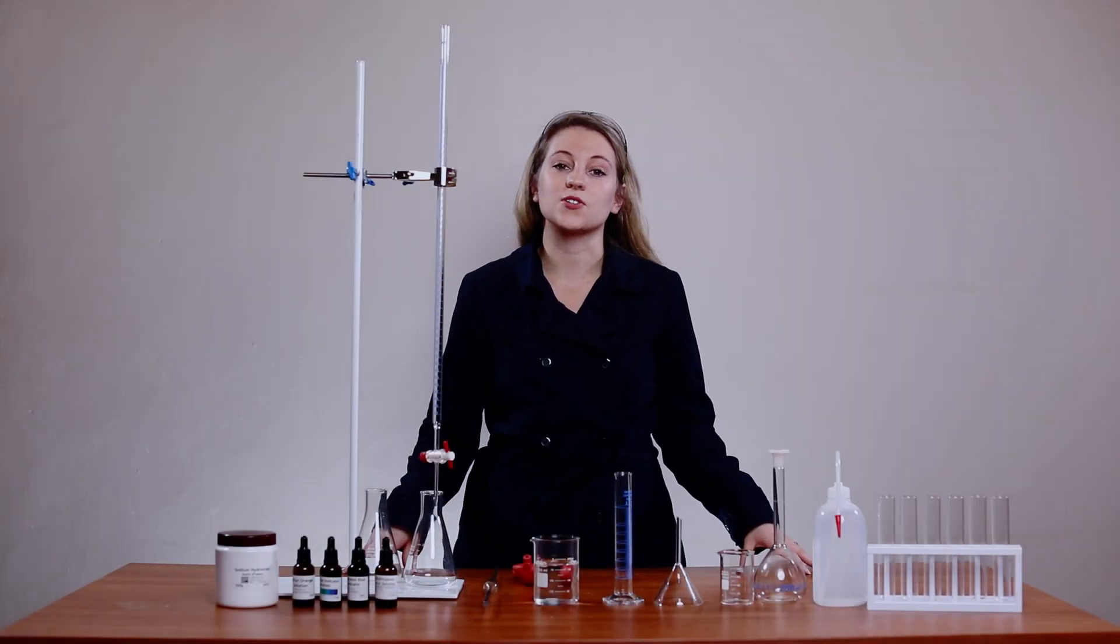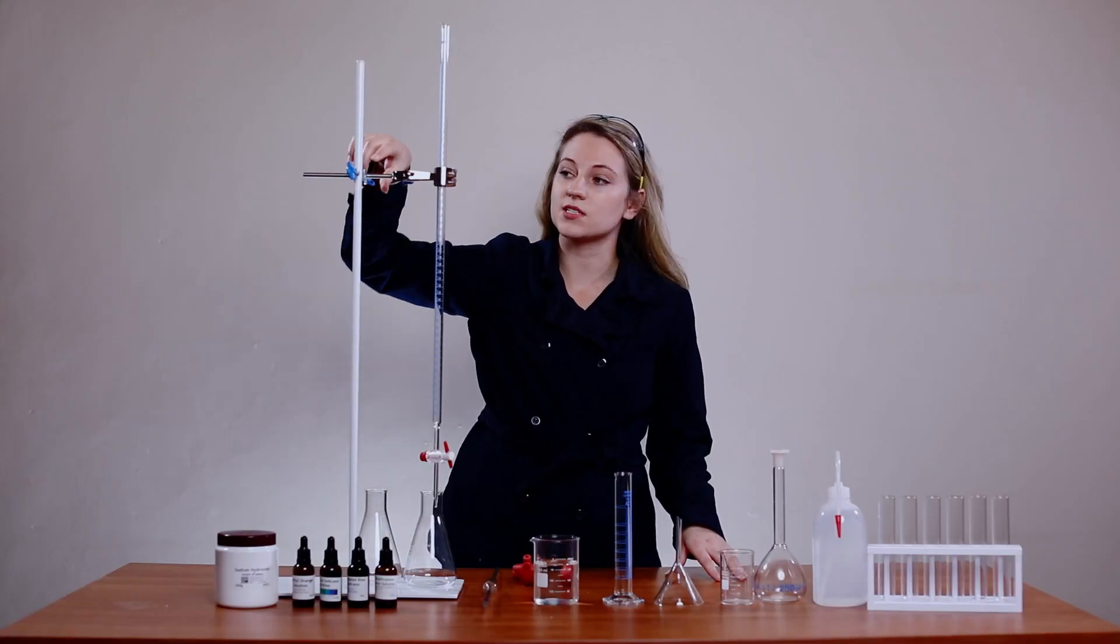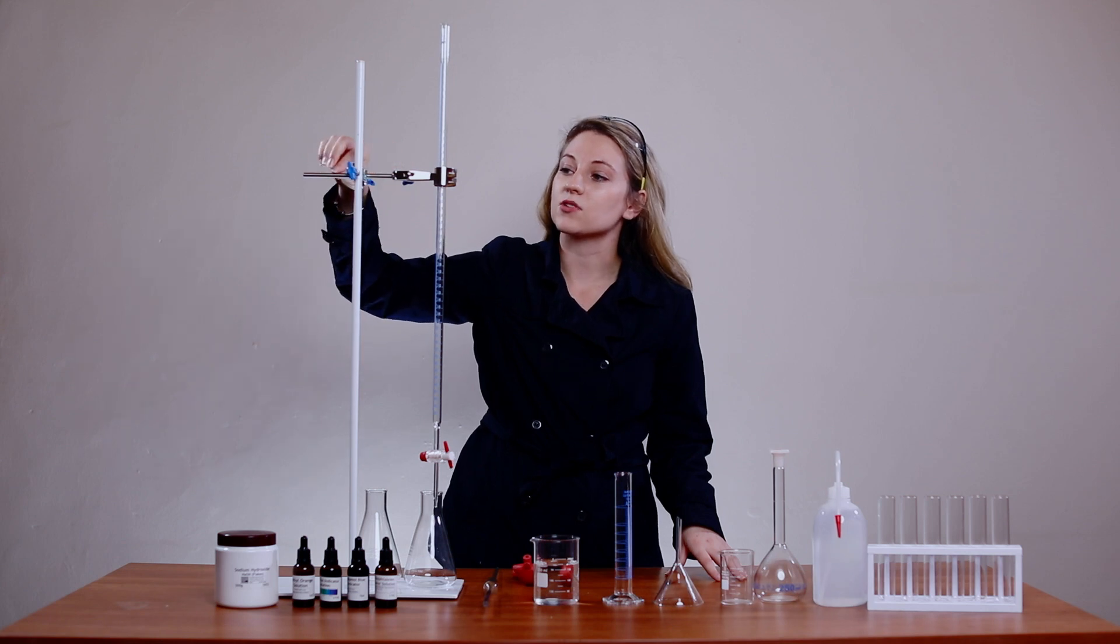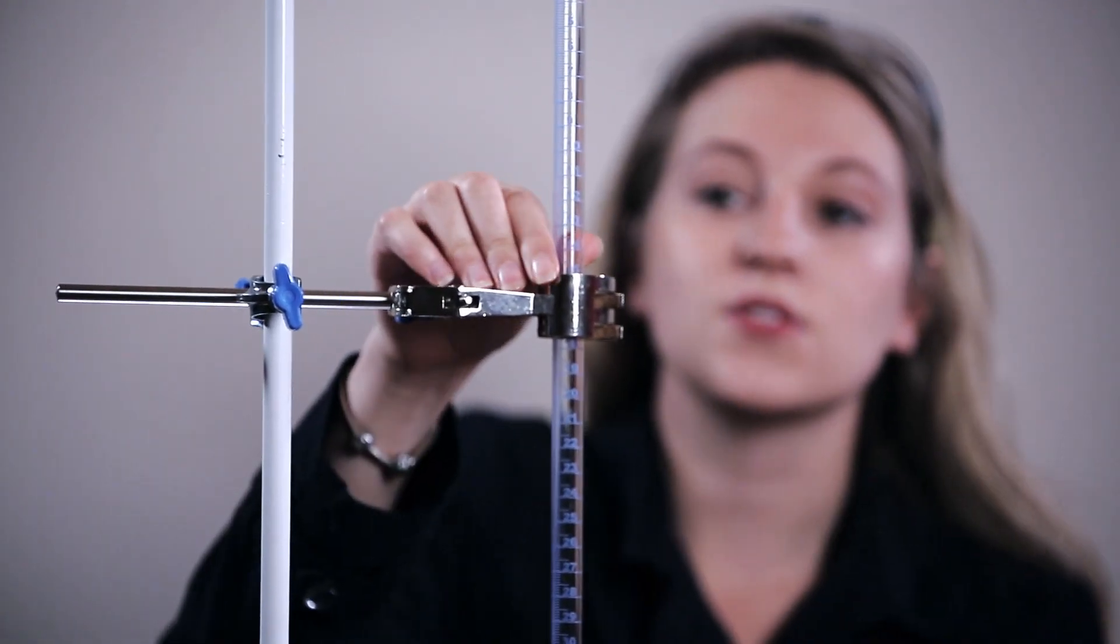Today's video is going to be on the equipment that you require to perform a titration. First of all, you need a stand and a boss clamp, which is this little clamp here, and also a clamp that can hold your burette.